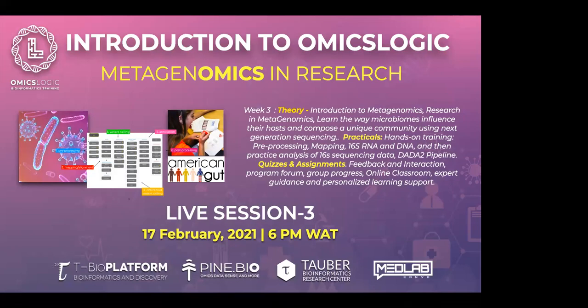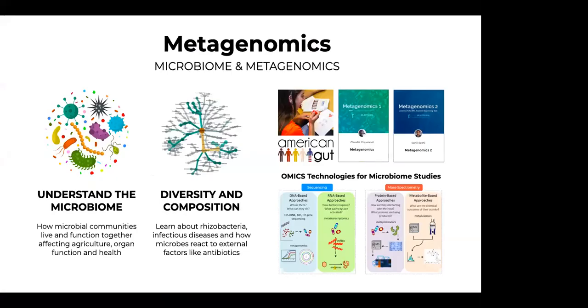Metagenomics refers to both a research technique and a research field. It can be defined as the genomic analysis of microbial DNA from environmental communities. So culture-free sequencing is one of the biggest advantages of metagenomics. In this, we will be learning about metagenomic data analysis, and you will have access to these three courses: Introduction to Metagenomics, and Metagenomics 2. They cover a wide range of metagenomics research.